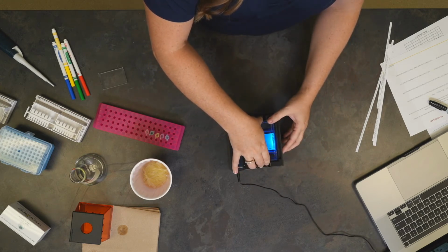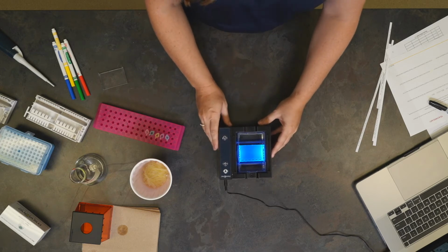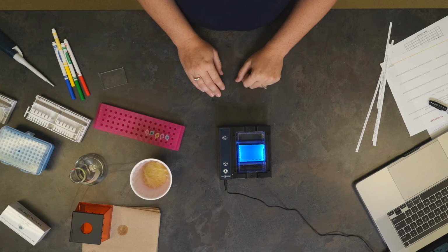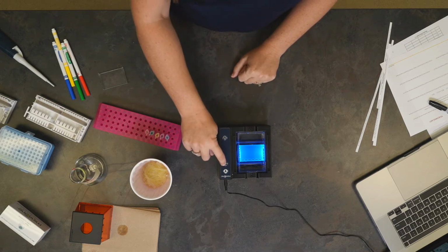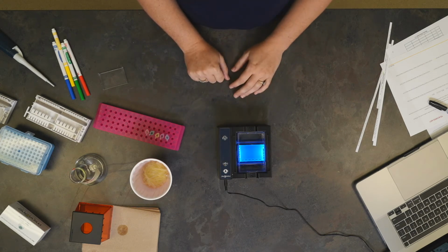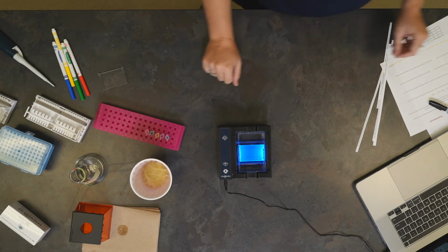If I have my carriage turned on, now the blue light is going to illuminate and we will be able to see the wells in the gel. If it does not turn on, just push the button. From here, we're going to go ahead and load the gels.